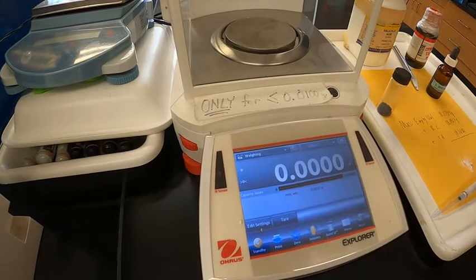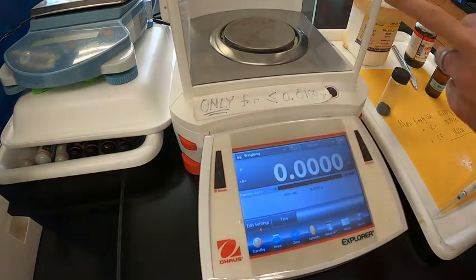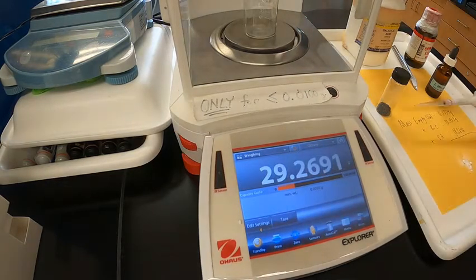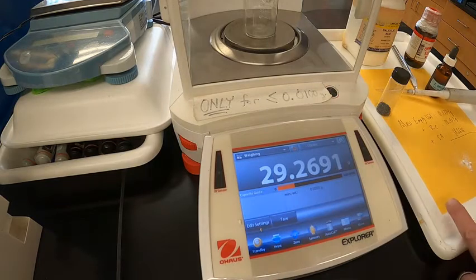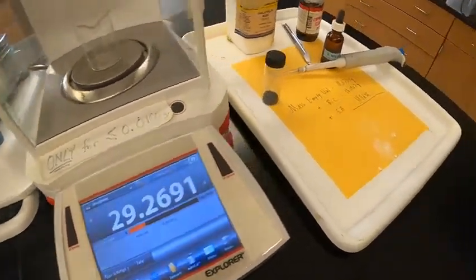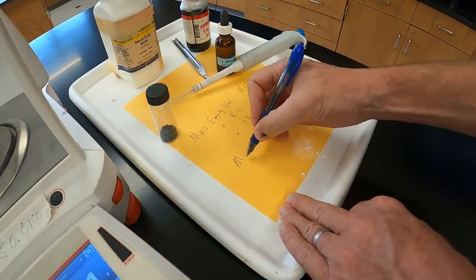And to do this, I'm going to mass out an empty beaker and then add the filter paper to it and mass it again. So I'll put it over here and move my mess. So here's the mass of the empty beaker.